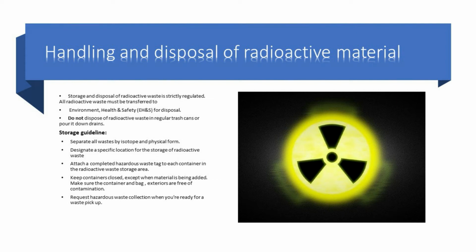Keep containers closed except when material is being added. Make sure the container and bag exteriors are free of contamination. Request hazardous waste collection when you're ready for a waste pickup.